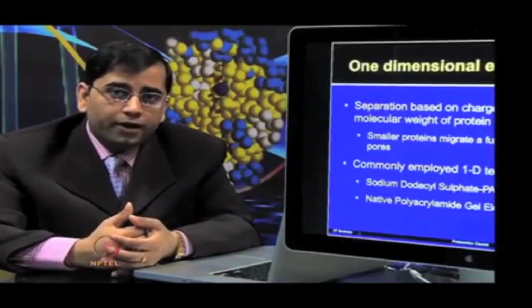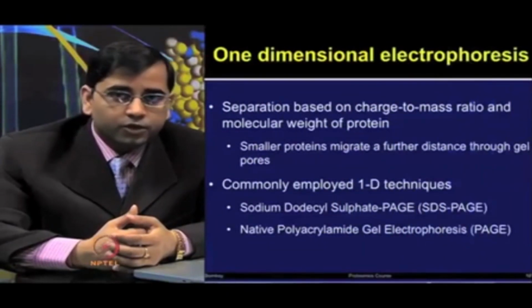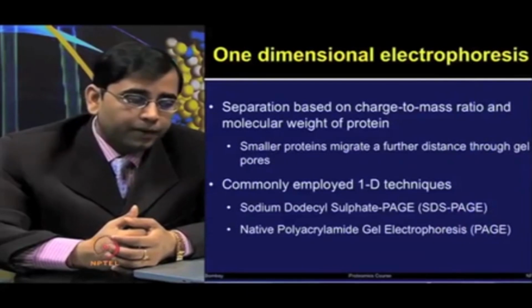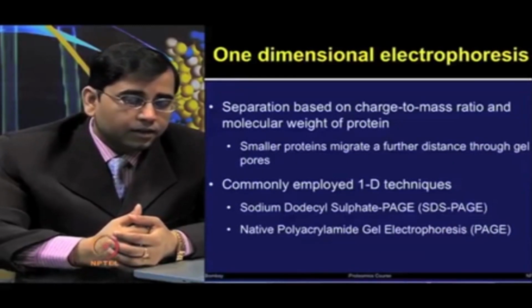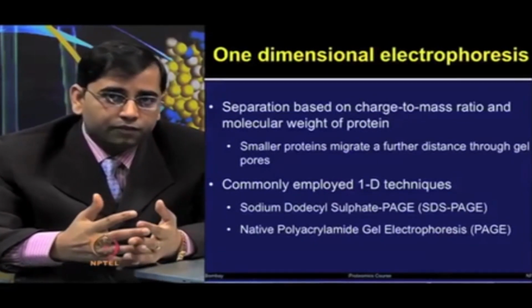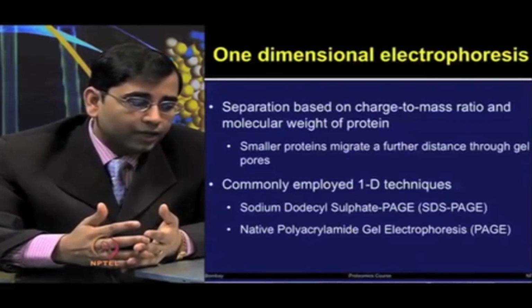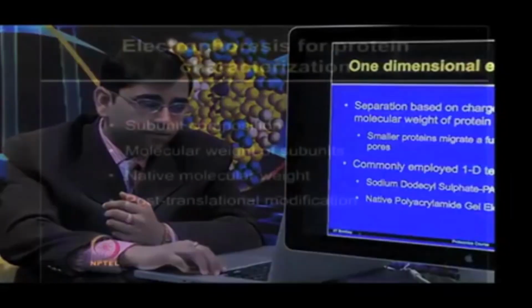Commonly employed one-dimensional techniques include sodium dodecyl sulfate PAGE, SDS-PAGE, or another technique which is used for studying the protein in the native conformation, native form, which is known as native polyacrylamide gel electrophoresis or native PAGE.